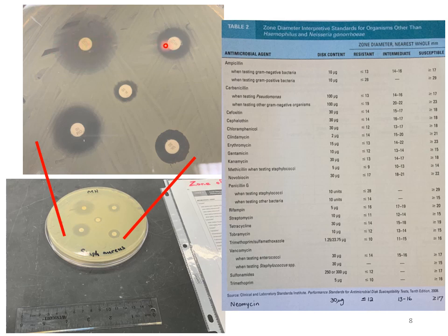For each one, you'd measure the diameter of the zone of inhibition. And then you would look on the chart here and check. So for instance, here we have penicillin. You would go to penicillin here and notice this is Staph aureus.